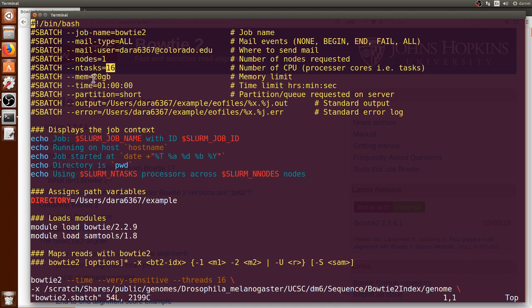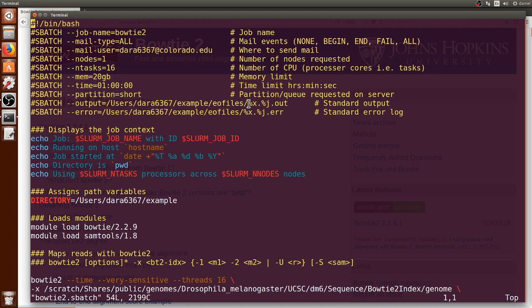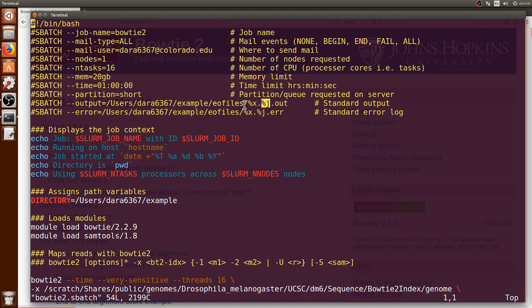And I'm giving it 20 gigabytes of memory so there should be plenty to run this alignment of Bowtie2 and also one hour as the time limit. I'm requesting that the output and error files be put in this directory and I'm using these two variables %x which will replace by the job name Bowtie2 and dot the ID of the job.